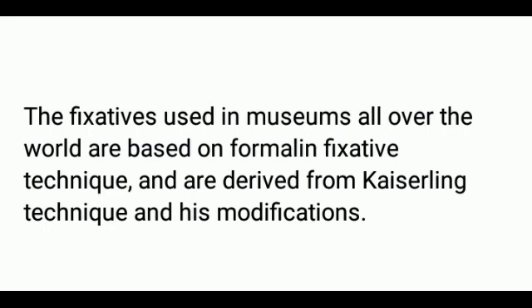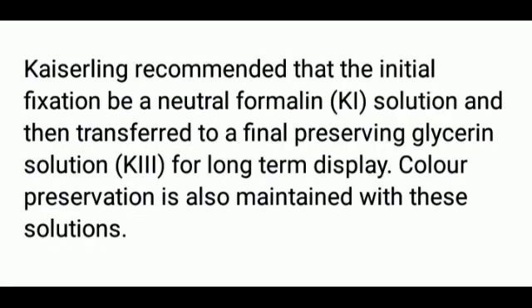The fixatives used in museums all over the world are based on the formalin fixative technique and are derived from Kaiserling technique and his modifications. Kaiserling recommended that the initial fixation be in a neutral formalin solution, K I, and then transferred to a final preserving glycerin solution, K III, for long-term display. Color preservation is also maintained with these solutions.